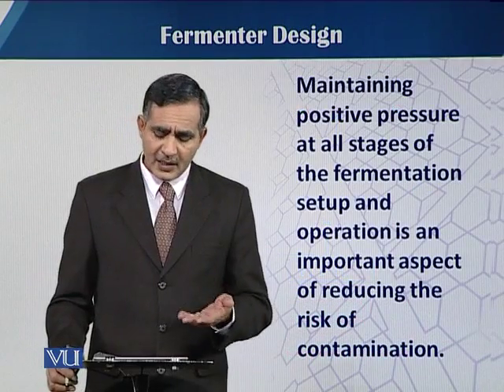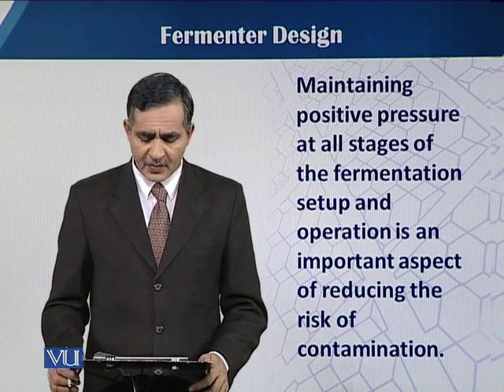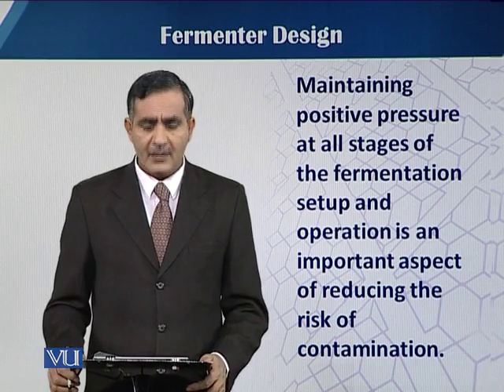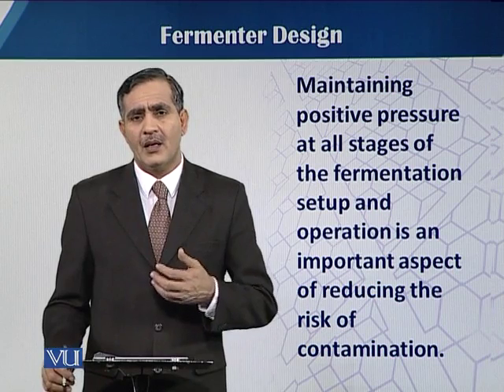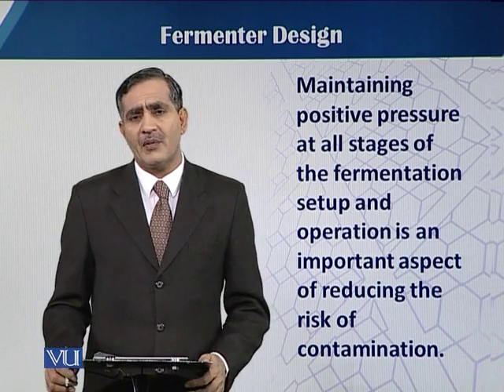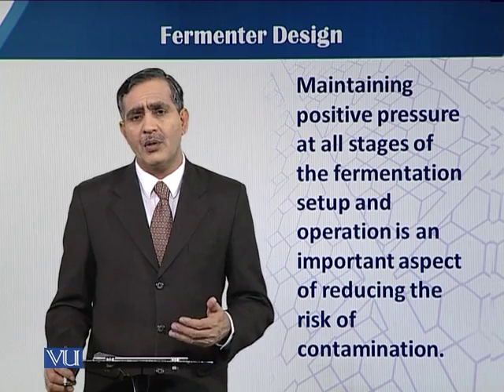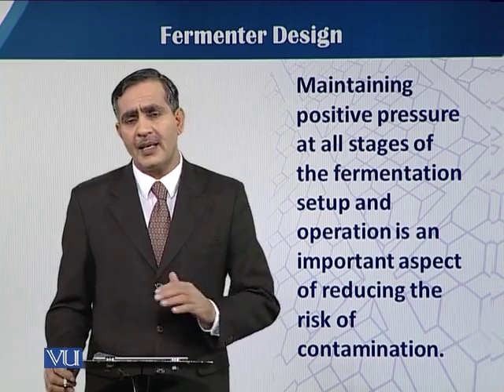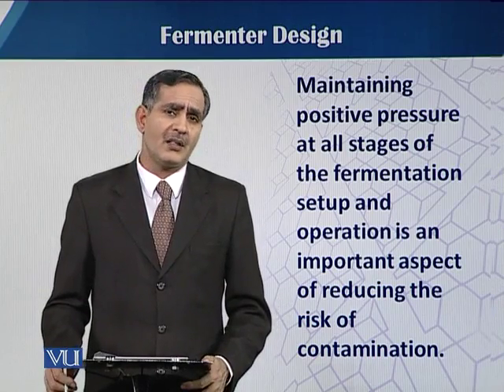Maintaining positive pressure at all stages of the fermentation setup and operation is the most important aspect to reduce the risk of contaminants in the fermentation vessel. That is the major role of positive pressure, and how we can control aseptic operation by the oxygen delivery system.